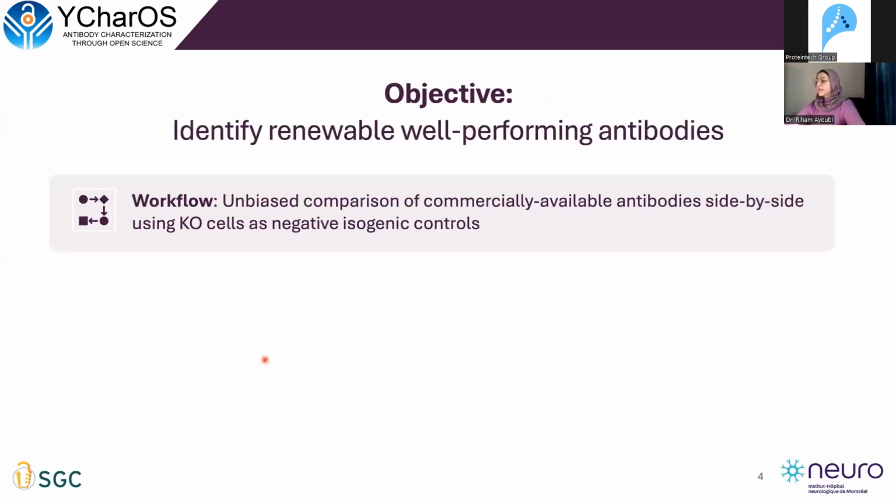This is why we started the YCharOS effort with the mission to identify top-performing antibodies for the whole community. Commercial antibodies are compared side by side in the presence of isogenic knockout controls.